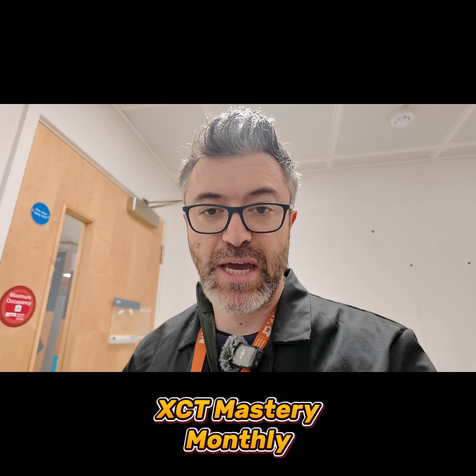Today I would like to show you how to perform a reconstruction. If you want to know more about CT reconstructions, please go and find my XCT Mastery Monthly issue and you will find all the information there. Now let's go to the NIKON reconstruction software and I will show you how to perform a reconstruction.